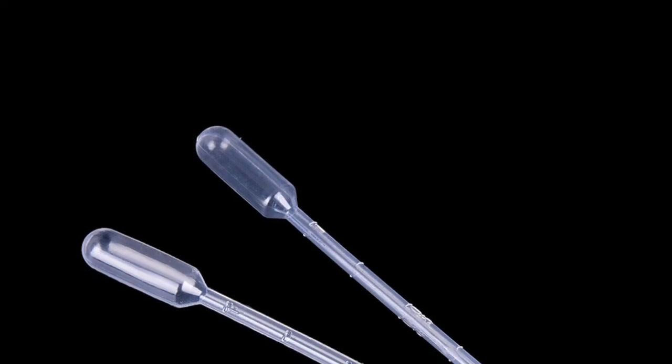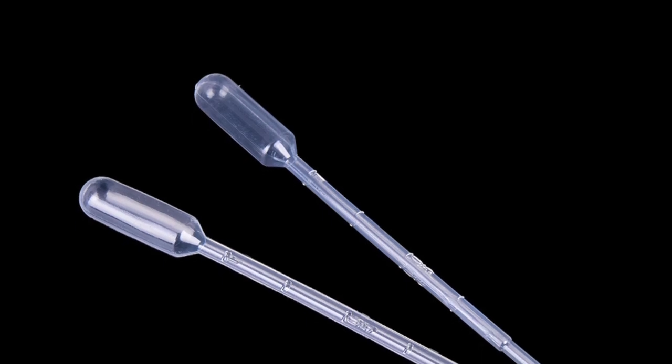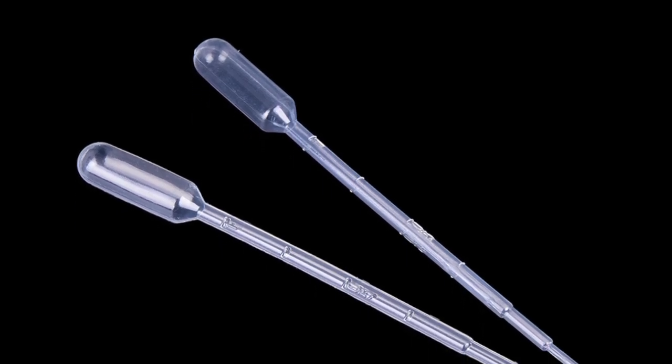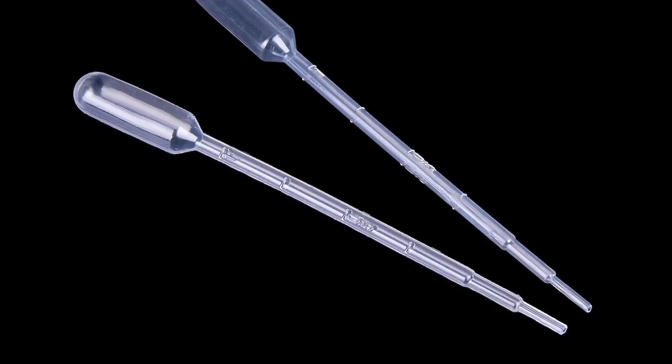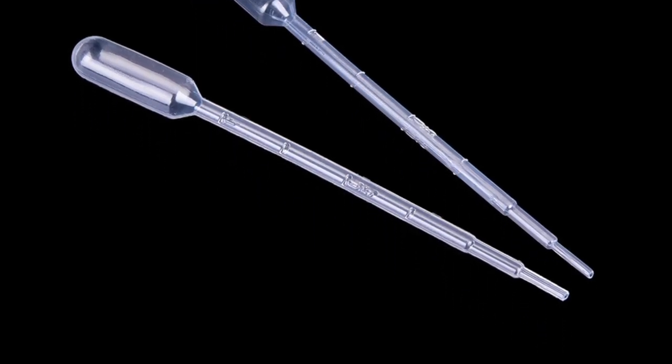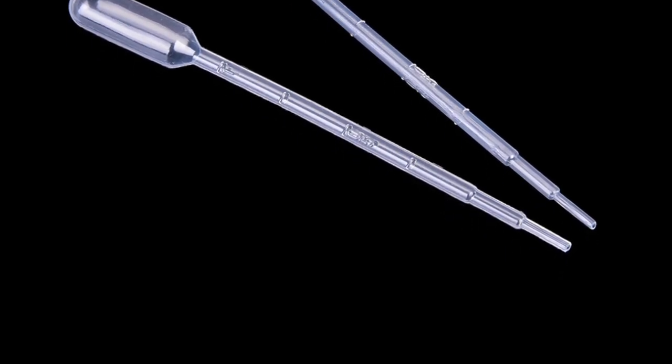Because these are very small volumes, you can use graduated transfer pipettes to measure the volumes down to 1/4 of a milliliter. You want to be very careful though that you're precise. If you don't do it carefully, you can end up having inaccurate data, especially when we get to the experiment.